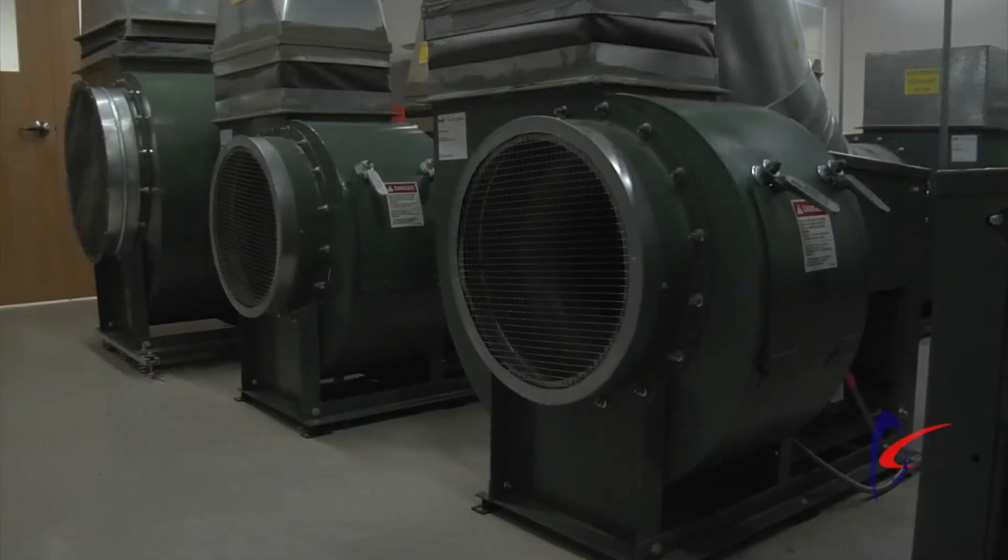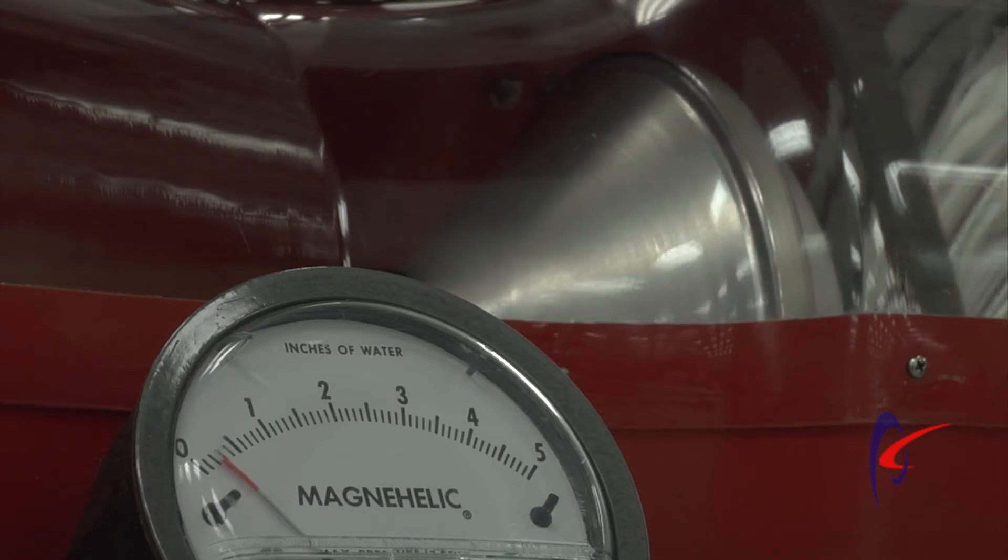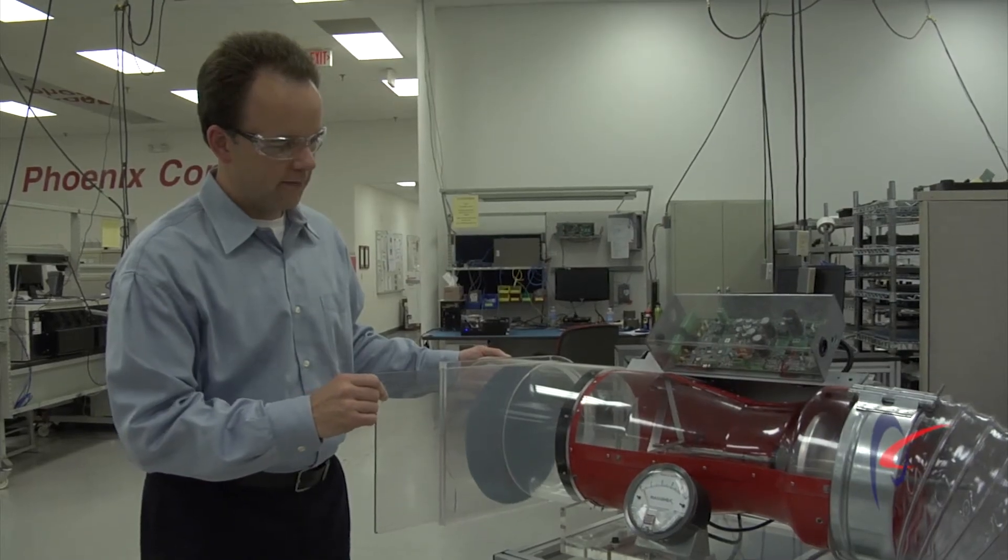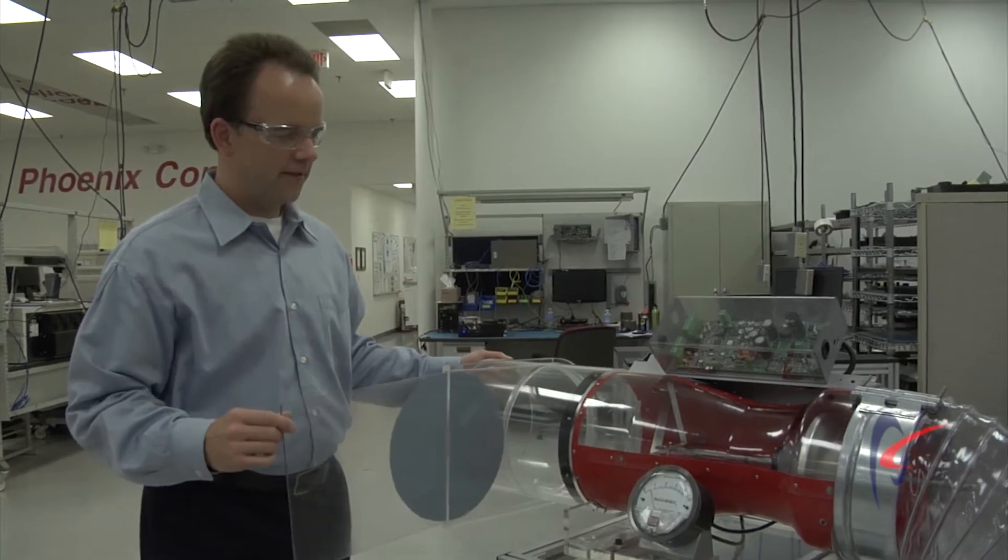What we'll do with the red valve is vary pressure. We speed up our fan. We start off with just three-tenths of an inch pressure drop. And with just that small amount of pressure, the cone is still able to maintain plus or minus five percent. Once we see that, we then ramp up the fan more and go to an inch total pressure.